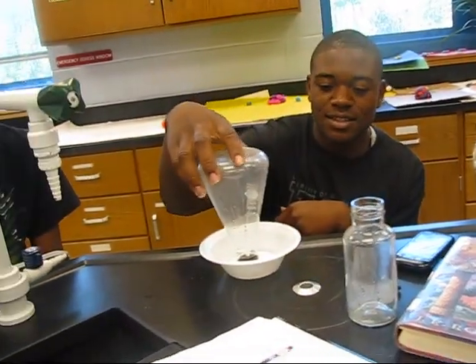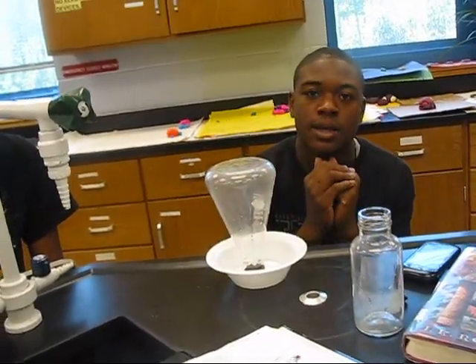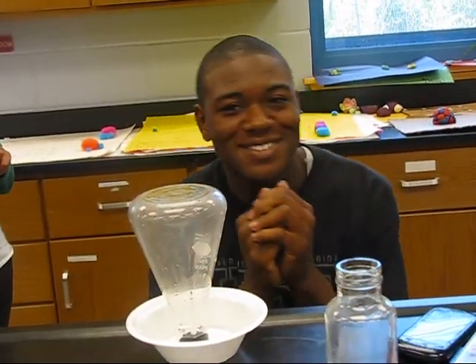So what happened to the light? It went out. Oh, the fire went out because there's no more oxygen inside the cylinder, and the fire needs oxygen to burn.